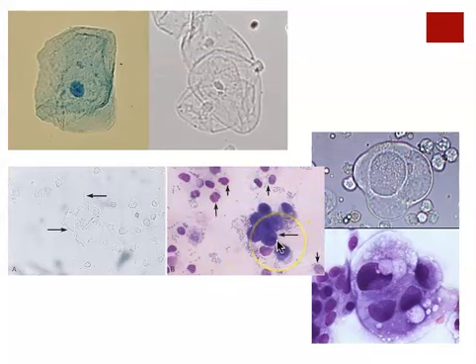And one of the ways that we distinguish cancer cells from other cells is by the fact that they look so abnormal. They stain differently. You can see they're much darker than these other nuclei. You can see that they're a different size, that they're shaped a little bit differently, that they're clustered together. All very abnormal. But I think you'll agree that the staining has brought out a whole lot of detail that we just couldn't see over here.